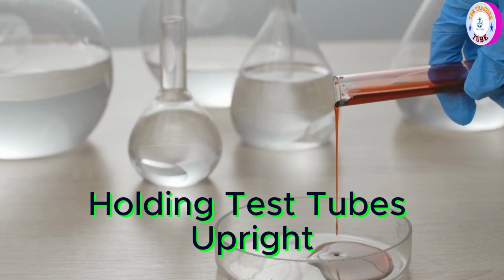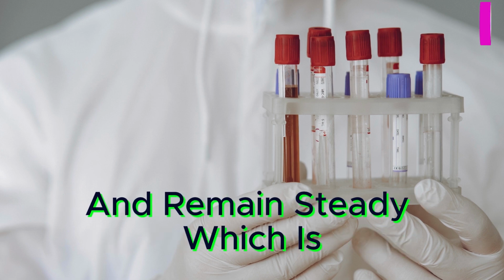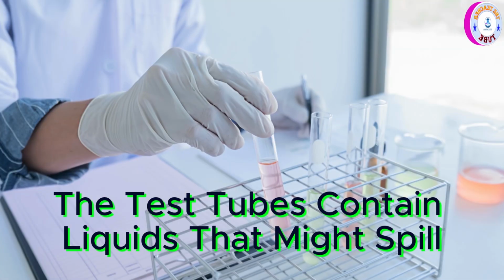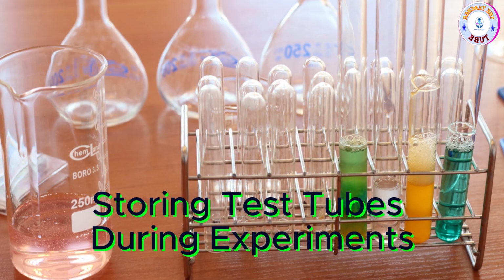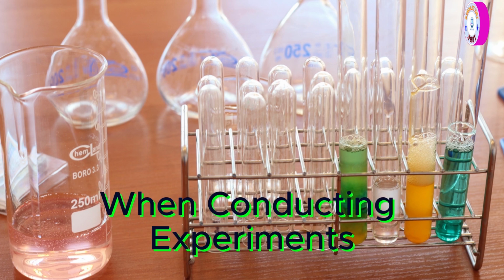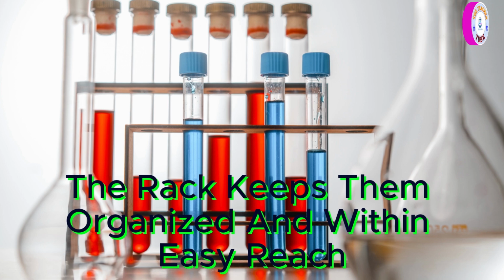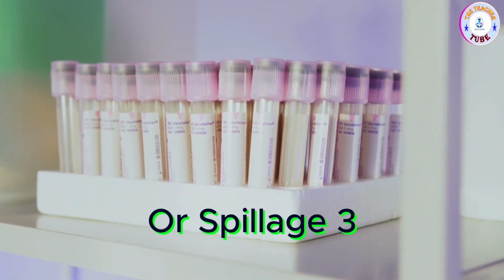Holding test tubes upright. It allows test tubes to be placed vertically and remain steady, which is especially important when the test tubes contain liquids that might spill if laid on their side. 2. Storing test tubes during experiments. When conducting experiments that require multiple test tubes, the rack keeps them organized and within easy reach, making it easier to handle them without confusion or spillage.